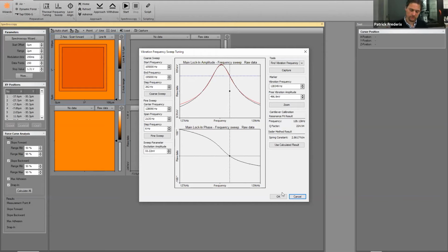It calculates the contact point of the force curve with the surface, and based on this information, you get the height at every point of the sample, and that allows you to get a topography. Of course, the resolution of the topography map is generally less than what you get with normal imaging, because you will not easily do a 512 times 512 points force map. Okay, but it's enough for an indication if you want to know that.